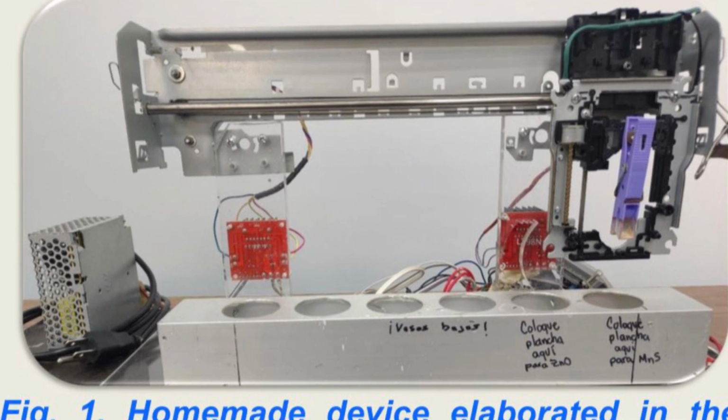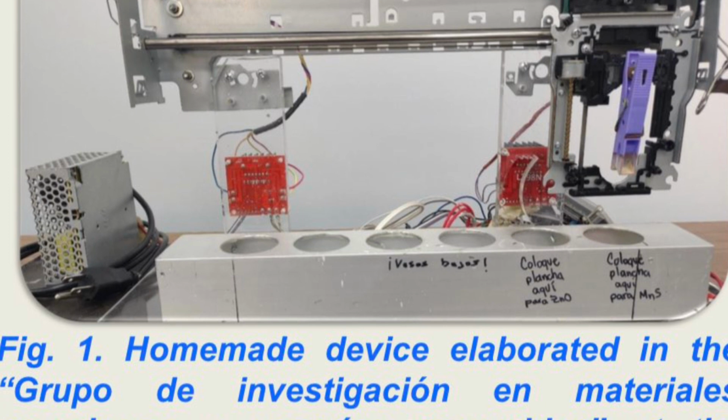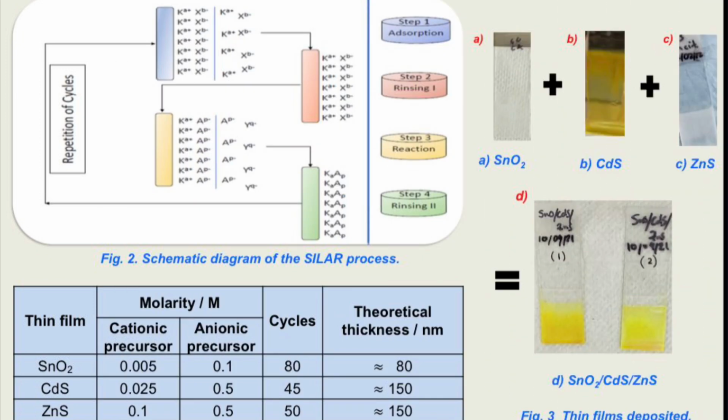In this project, we use a homemade equipment presented in figure 1 to synthesize this multi-layer structure. As experimental details, we show you in figure 2 a schematic diagram of the SILAR process. Basically, the SILAR methodology is the successive ionic layer adsorption and reaction.